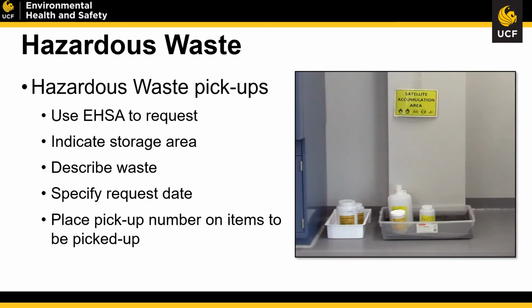In the event that you have to put in a hazardous waste pickup, this pickup request will be done through EHSA. Your laboratory manager or your PI will authorize that module to be added within your account. Then you put an individual pickup request in. That pickup request will need to indicate where that waste is being stored, what that waste is, and a date on which you would like it to be picked up.